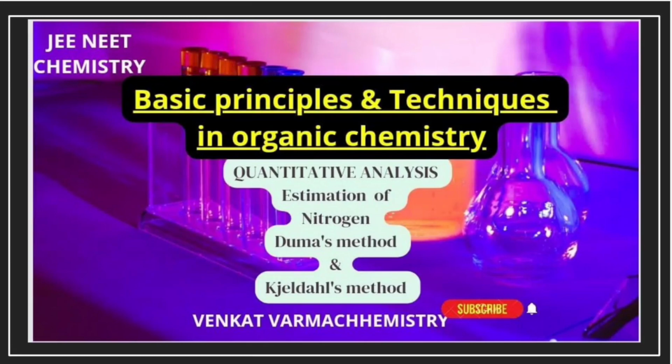In this session, I am going to discuss estimation of nitrogen, Duma's method and Kjeldahl's method. In the previous session, we learned about estimation of carbon and hydrogen and the calculation of the percentage of carbon and percentage of hydrogen. In this session, I am going to discuss estimation of nitrogen by using Duma's method and Kjeldahl's method.